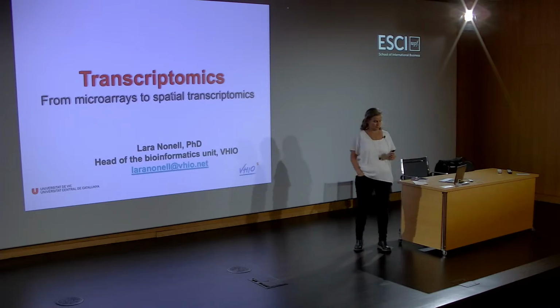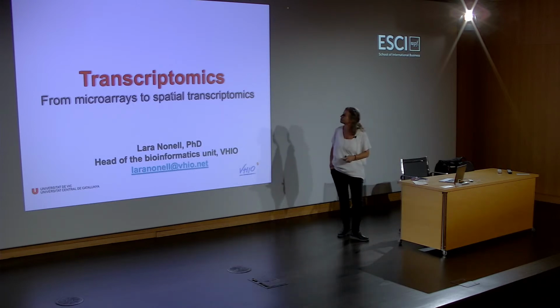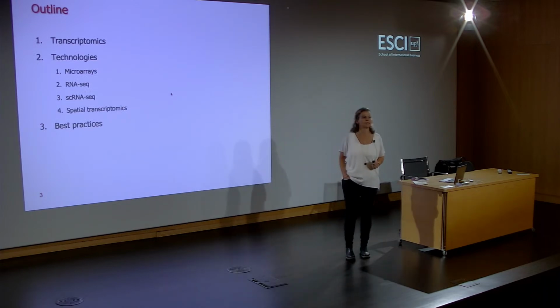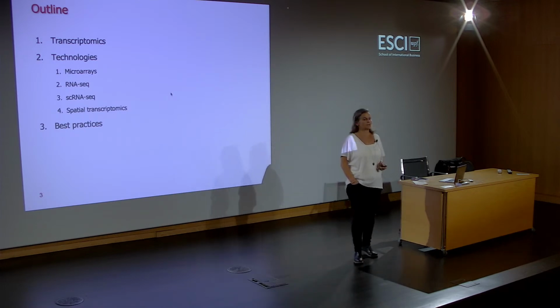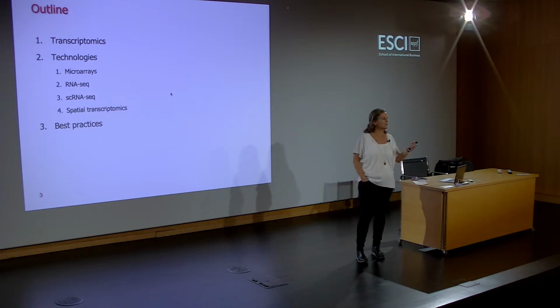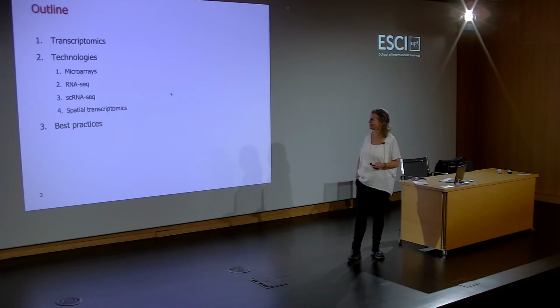This is the outline. We will review what transcriptomics is and some of the technologies. And at the end of the talk, we will see some of the best practices in analyzing this kind of data.